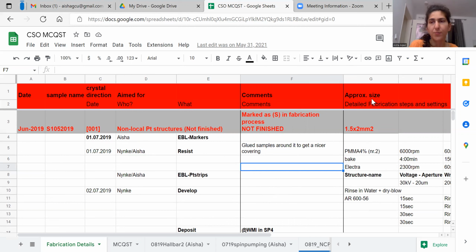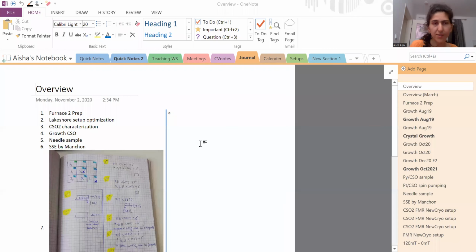Then the second thing I would like to share. After you have placed the very important information about your equipment and daily things in an Excel sheet, you can then put in details, because you also need details about some things. Here is an example.